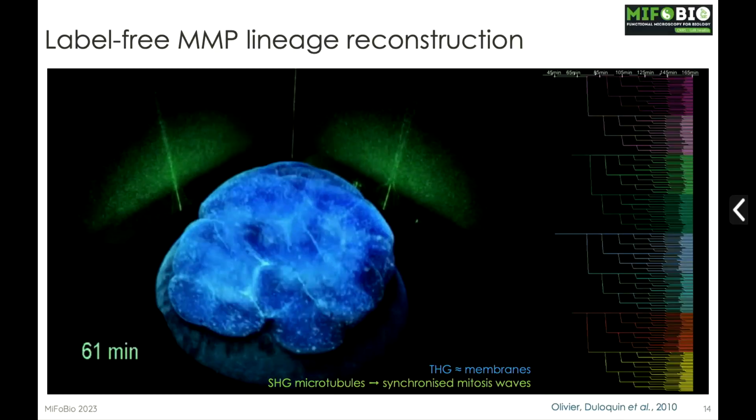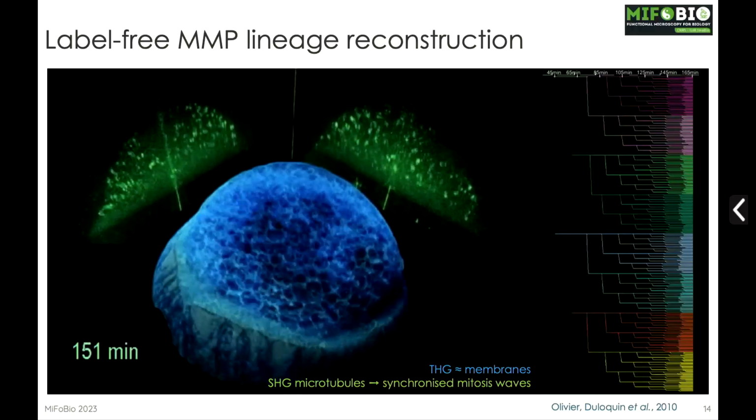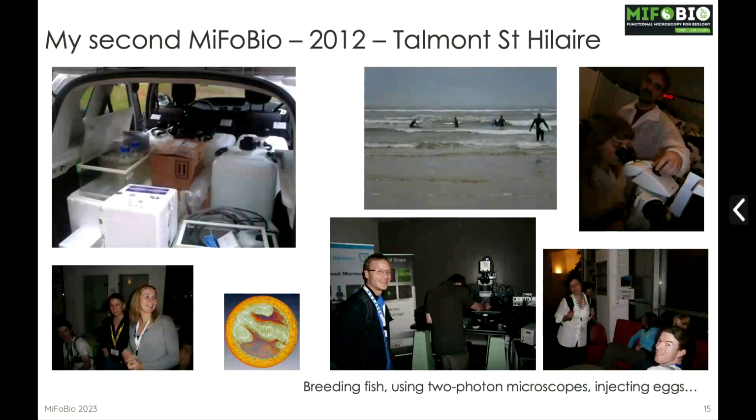And I got lucky to join Nadine Peyriéras's lab, where we had a good time, including the first MiFoBio with them. And that was really an adventure. We took the fish tanks, the water, everything to build the fish facility on site. There was a really nice 2-photon microscope, and the people from LaVision BioTec were super nice and gave us all the advice. We were injecting the same way as we are doing right now. So for me, it's really nice.